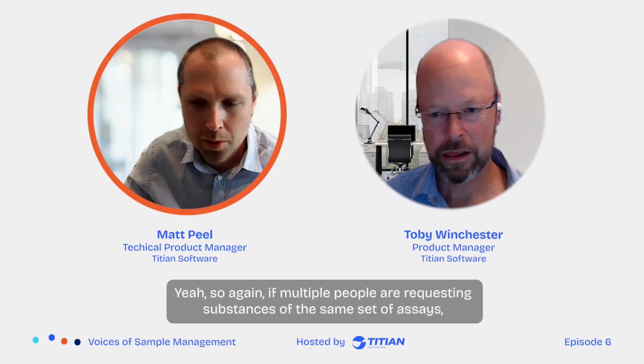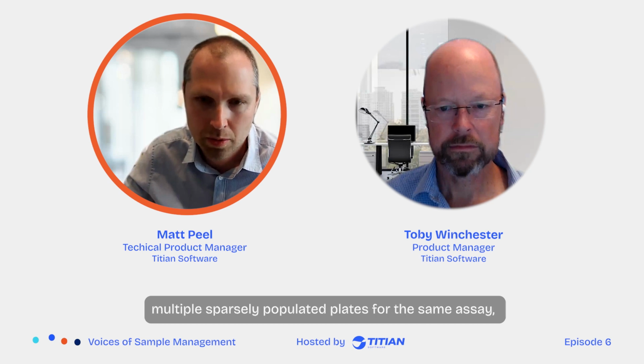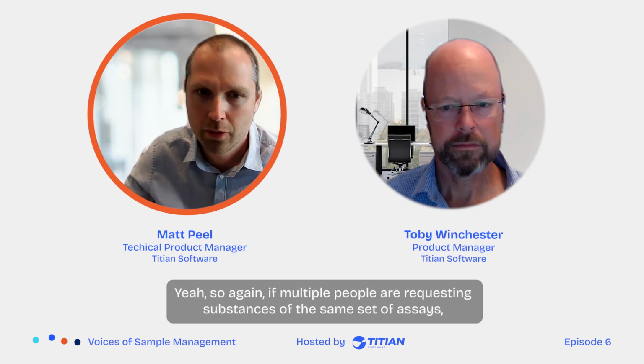Yeah, so again, if multiple people are requesting substances for the same set of assays, you don't want to be creating multiple sparsely populated plates for the same assay. You want the sample bank staff to be able to see all the requesters that have requested for that assay, and be able to pull the work together and create consolidated plates, as many full plates as you can, and then send all of those in one go to the assayist.